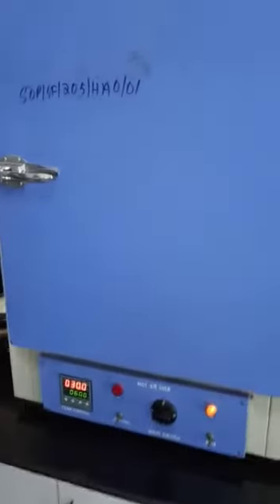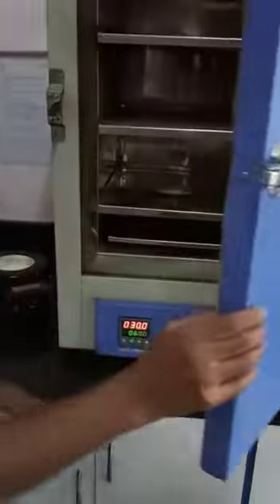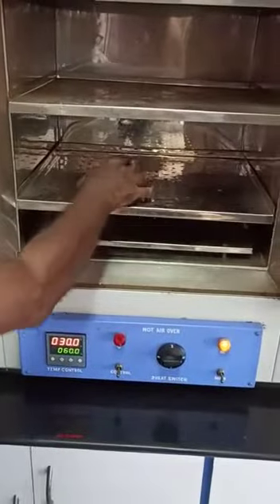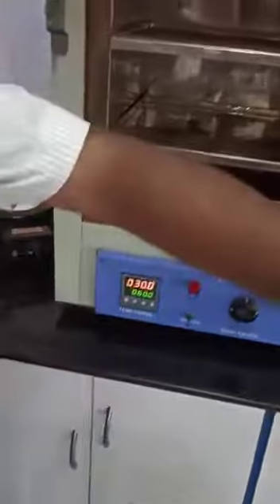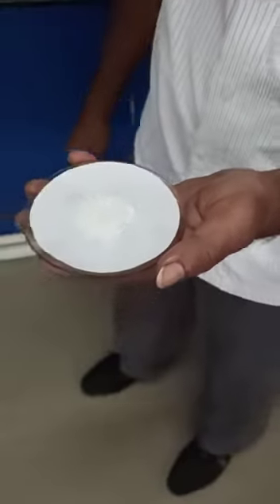After half an hour is completed, we will take out the aspirin from the oven. Now we will take out the synthesized aspirin. The aspirin is dried completely — we got the white powder. Now we have to weigh how much powder we have synthesized; we will weigh this aspirin.